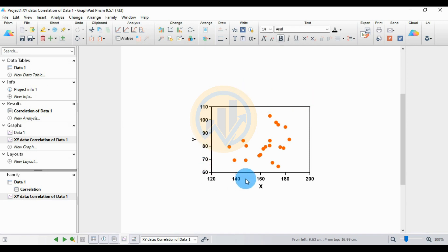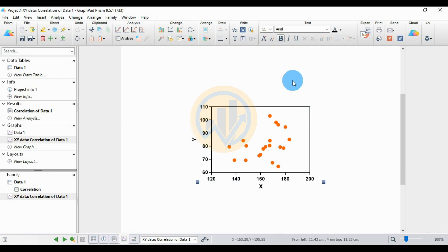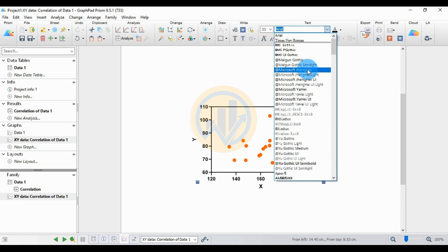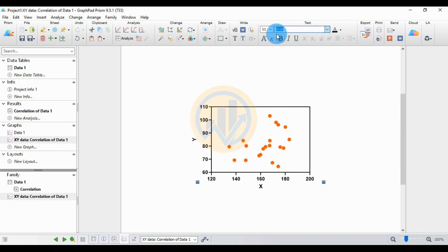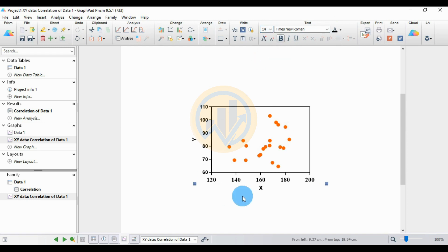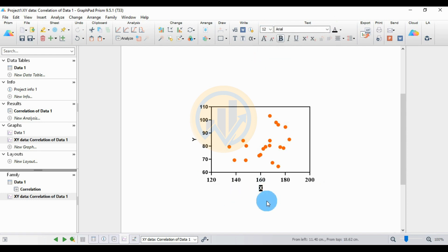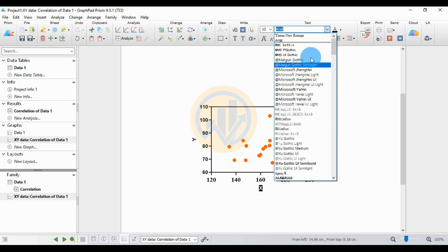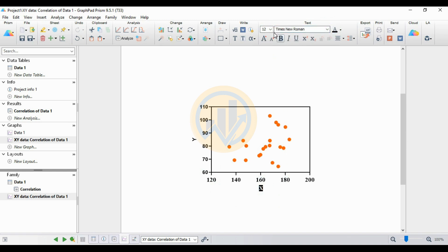Click OK. Now delete the default title and change the X and Y axis font style. Select the X axis and change the font to Times New Roman, size 14. Do the same for the Y axis, setting the font to size 14.